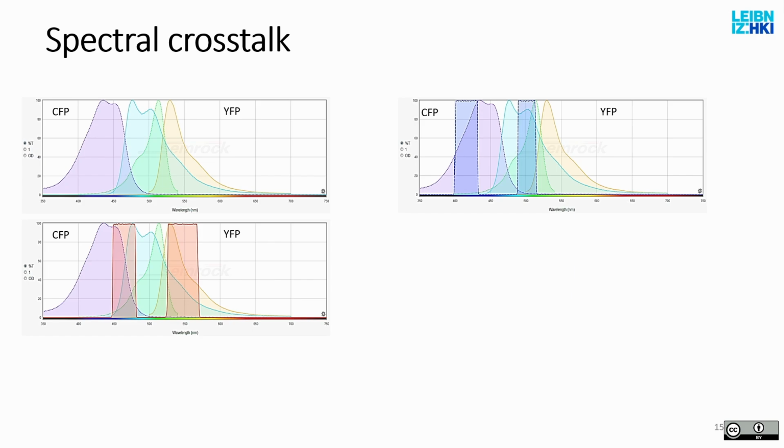So with live cell microscopy, where you don't necessarily have the chance to have just a control label that you very nicely described, where you only have one label, or you only have 2 labels out of the 3, and you can measure the crosstalk, you still need to be able to do microscopy. And then you have to live with the fact that there is a crosstalk. And in this case, it comes to you as an image analyst, which you now slowly become, to get rid of this crosstalk, like we did yesterday with the exercise.